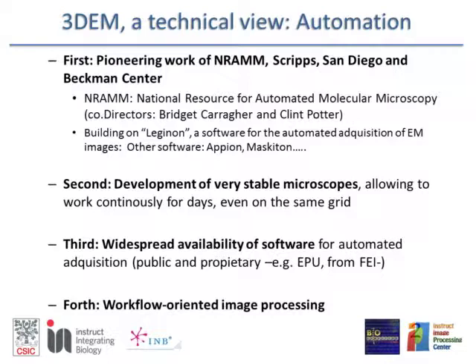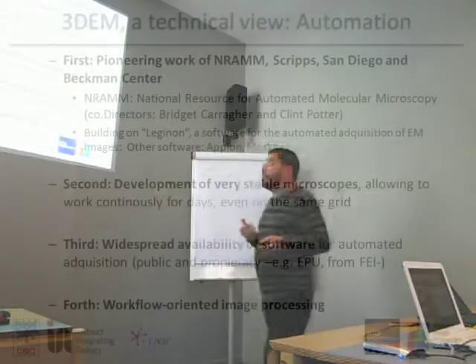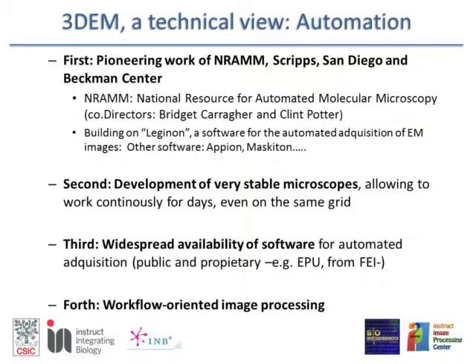So this is a high throughput approach that really is paying a lot, and is going to be the basis of how we are going to work, how we are working already, and how we are going to work more in the future. Before, in the US especially, there were some infrastructural centers. Now in Europe, this is what we are going to have, 4 or 5 infrastructure centers in which the best microscopes are going to be there, and the access to those microscopes is going to be fully automated. And really, you are going to be running the whole thing for hours without touching anything, and with a lot of controls going on behind. And also automation talks about image processing, that is the topic of this session, in a very integrated manner. It's not only one operation, it's a complete series of operations in a workflow. And you're going to see how everything we do here is in the range of workflows.